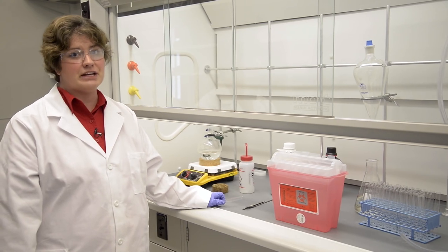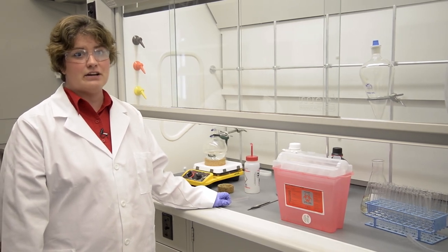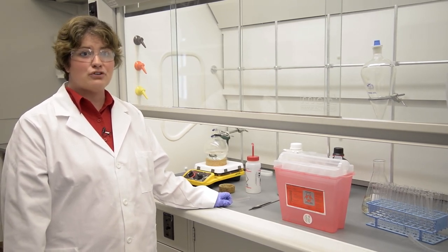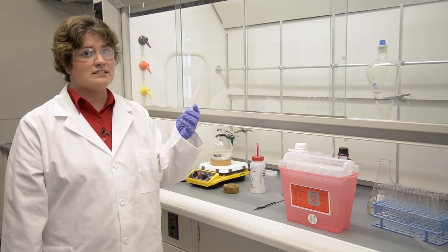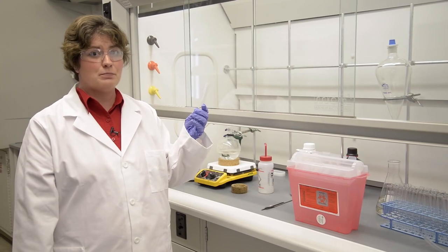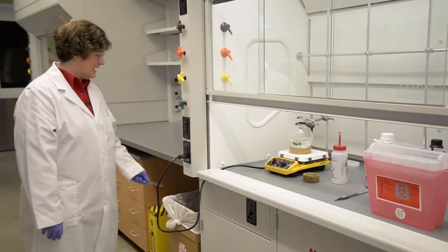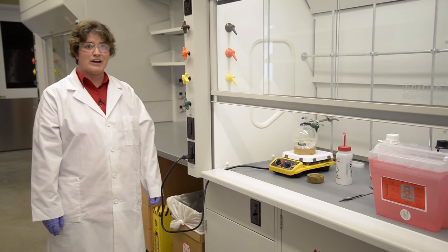Speaking of glass trash, whenever you break something made of glass, you want to be sure and pick it up with a broom and dustpan and not your hands. The glass trash can be used also for things like test tubes, glass slides, and glass pasteur pipettes. Never put glass into the regular trash.